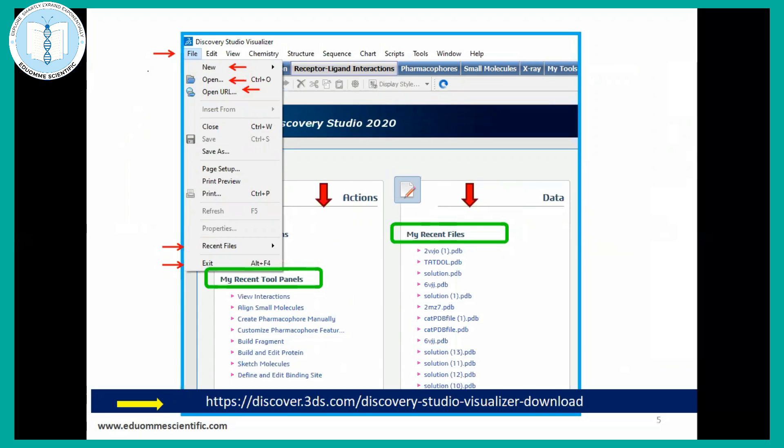If you already have work structures file, you may open from here or you may get it from the URL. Tool panels are given here and history is also provided here.